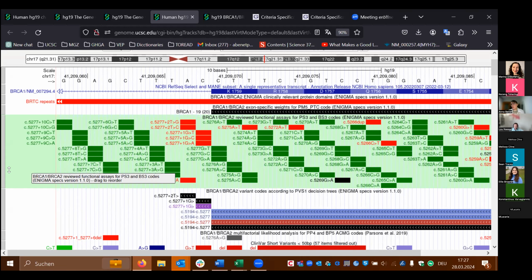Okay, so for example, in the browser, I feel comfortable if I have this open. For sure here you can look for the variant, but you will have to look for the variant. If you look for the gene, you end up on the gene view, and it is very overwhelming because there is a lot of data in these tracks. So first of all, the visualization will not be very good. So the best thing is always to look for the variant, and you can type any HGVS nomenclature, and it will direct you to the variant position.